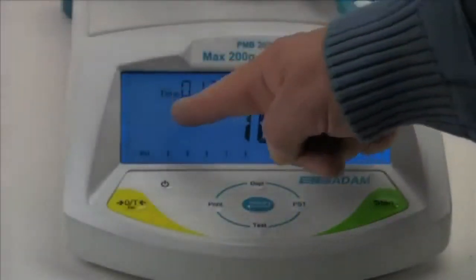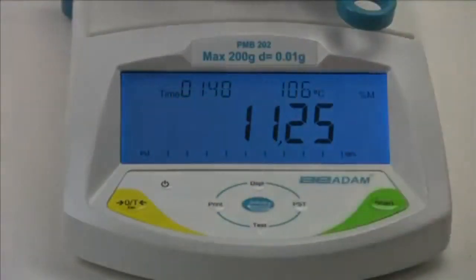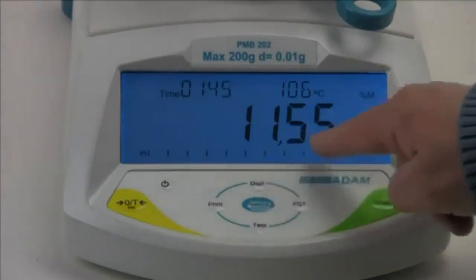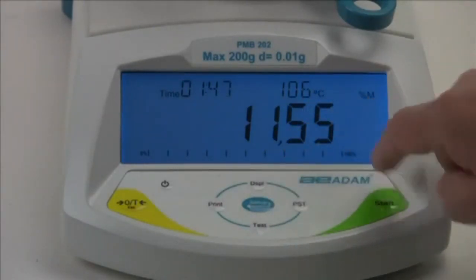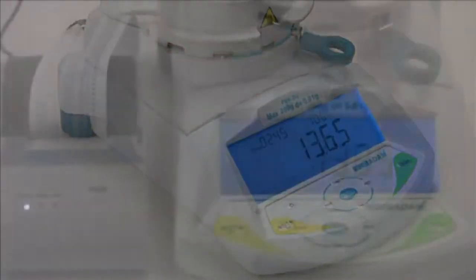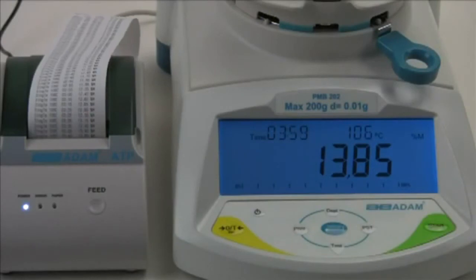Close the lid to begin the test. The display shows complete test information including the elapsed time, the temperature inside the chamber, and in this example, the percentage of moisture removed from the sample. If you have an Adam printer connected, you can output the test results for a printed record.